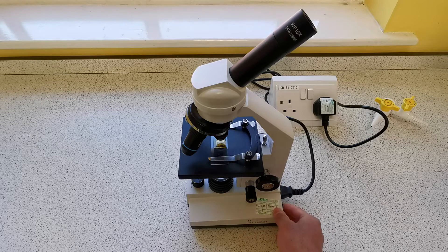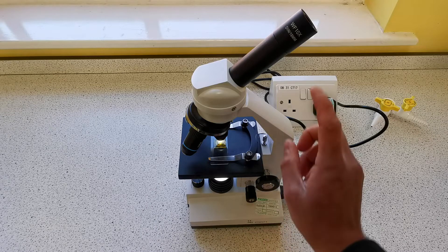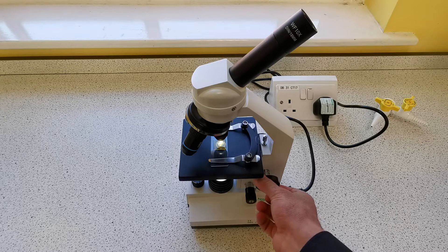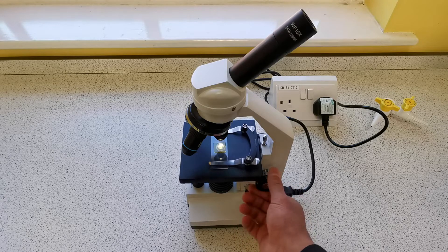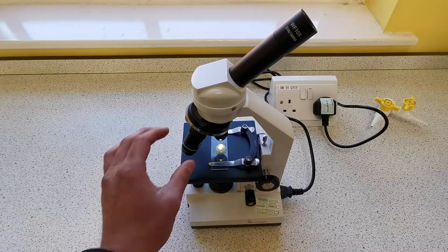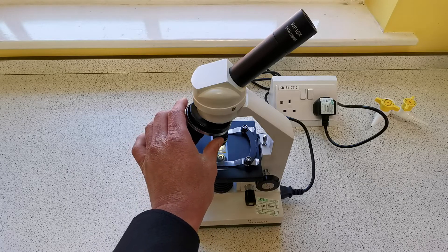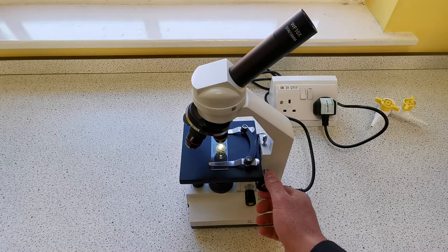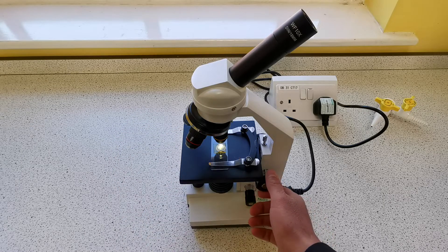I'm going to turn it on and adjust the brightness so it's bright enough. Then I'm going to look through the eyepiece lens, move it away to get a rough image, and then once I have the rough image I can use the fine focus to get a clear image. Once I'm happy with that, I'm going to move it back down to the lowest position and select an objective lens with a higher magnification — times 10 — to see the cells in more detail.